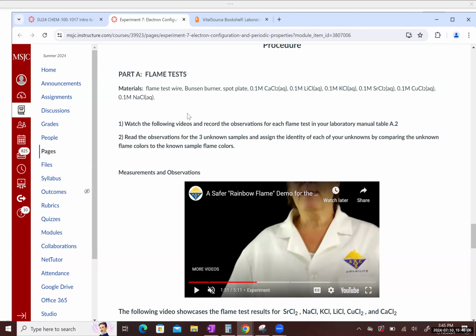So in this case, I prepared some videos. You're going to watch these videos and you're going to record your observations for each flame test in your laboratory manual. You're also going to note and record the observations for the 3 unknown samples. From this, we're then going to assign the identity of each of the unknowns by comparing the unknown flame colors to the known sample flame colors.